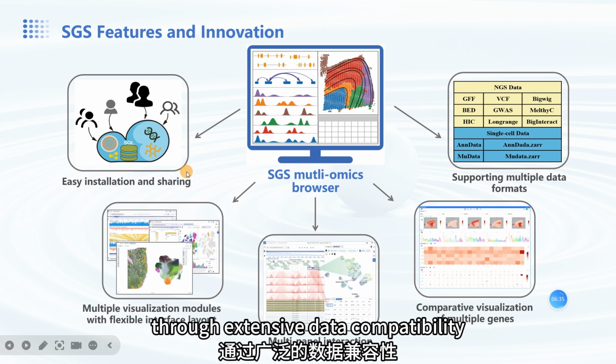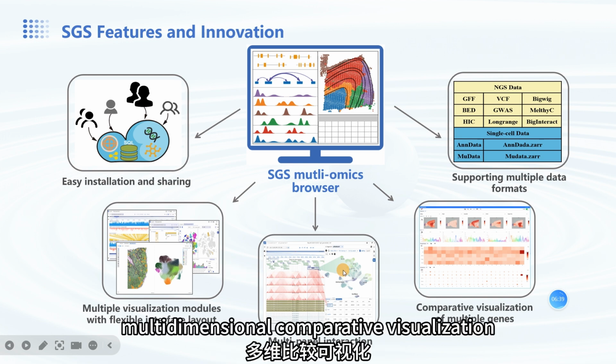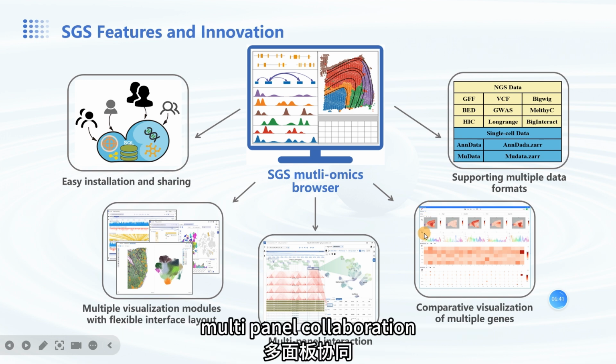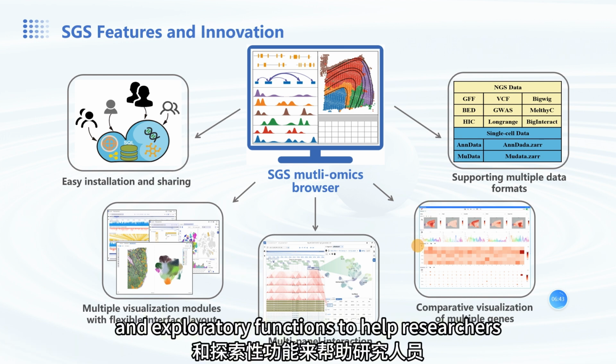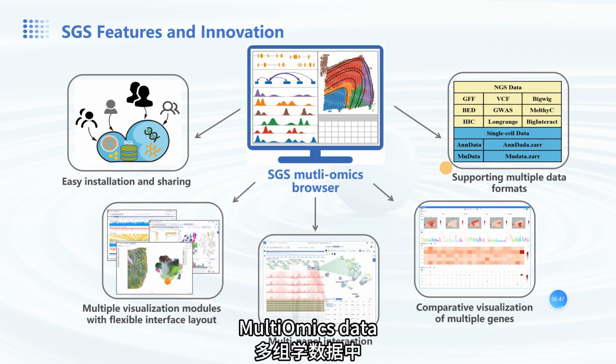Through extensive data compatibility, it offers rich visualization modules, multi-dimensional comparative visualization, multi-panel collaboration, and exploratory functions to help researchers gain new insights from multi-omics data.